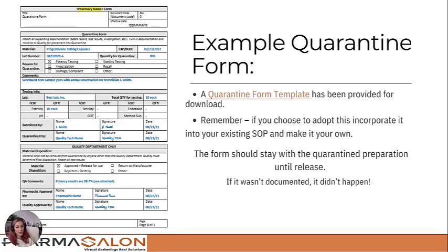And then we have a few different tests that we perform frequently listed on this form: potency, pH, sterility, container closure integrity, endotoxin, and method suitability. If you're not a sterile pharmacy, those last 4 probably not going to be for you. Again, this is a Word document, so you can edit it and put in the testing that you most frequently send out, so this form makes sense for your pharmacy. Then there's a section for the person to submit the form to sign, and then for the person who is putting the item into quarantine to sign.